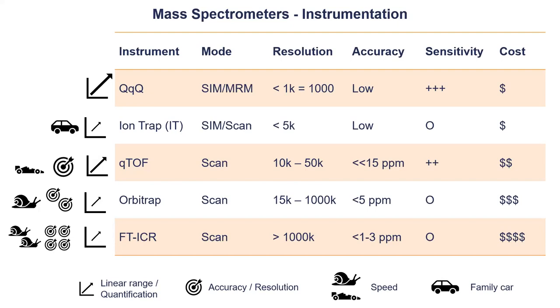If you do method development, you can use a system that is maybe less frequently used. At least in our old lab it was like this, all people wanted to use the new machine. But especially for method development, I think it's still nice to use a machine that is not so occupied. You can do the method development, and then if you want to have a paper out of it, you can switch and have the real samples running on the system in the end.